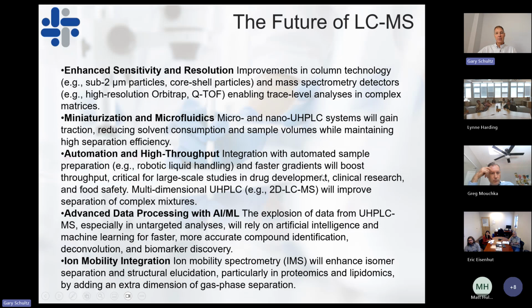Of course, with all these systems that scan at high resolution and with faster and faster scan speeds, we're generating an enormous amount of data. And that data becomes the bottleneck now for analyzing that data to make sense of what we're seeing. And so there's a lot of developments today, again, in artificial intelligence and machine learning, in order to go through this data, in order to help identify the small molecular changes that take place in these untargeted analyses.